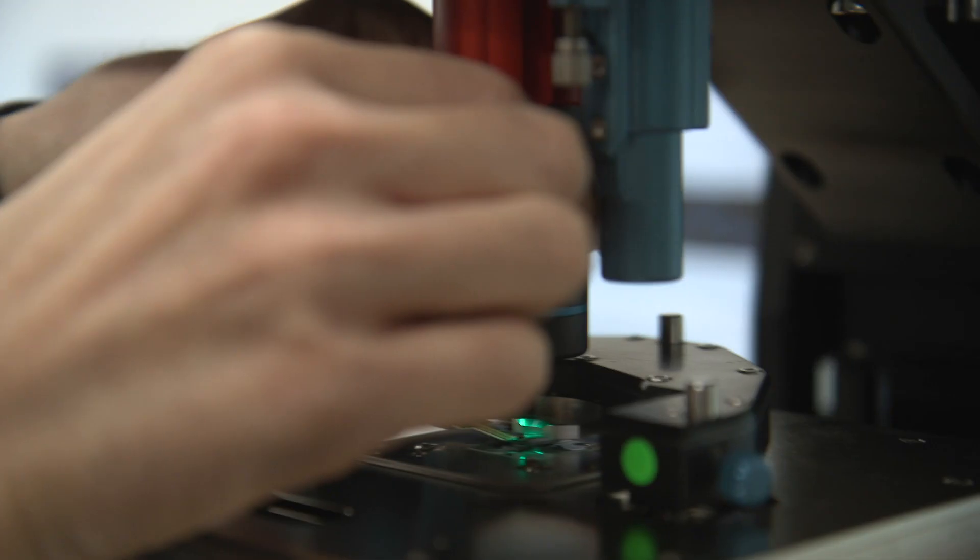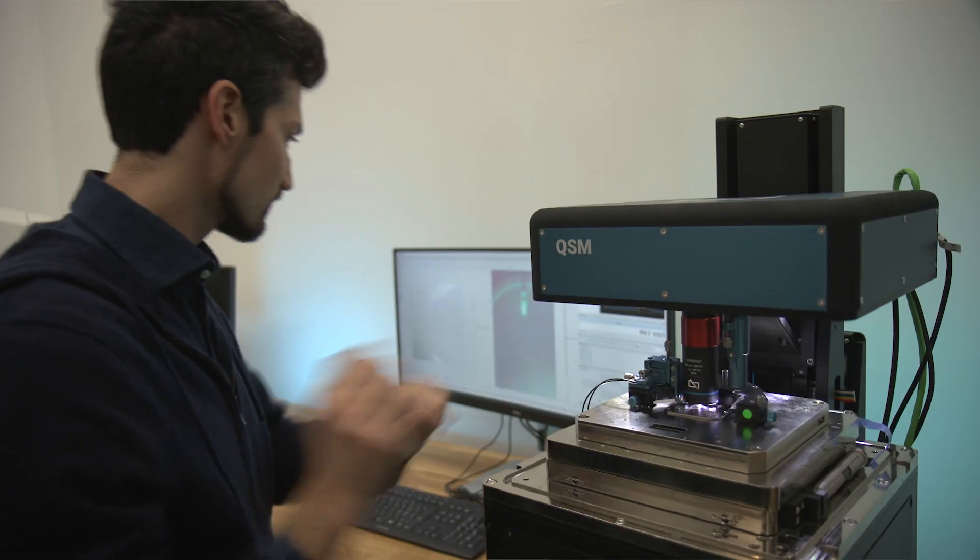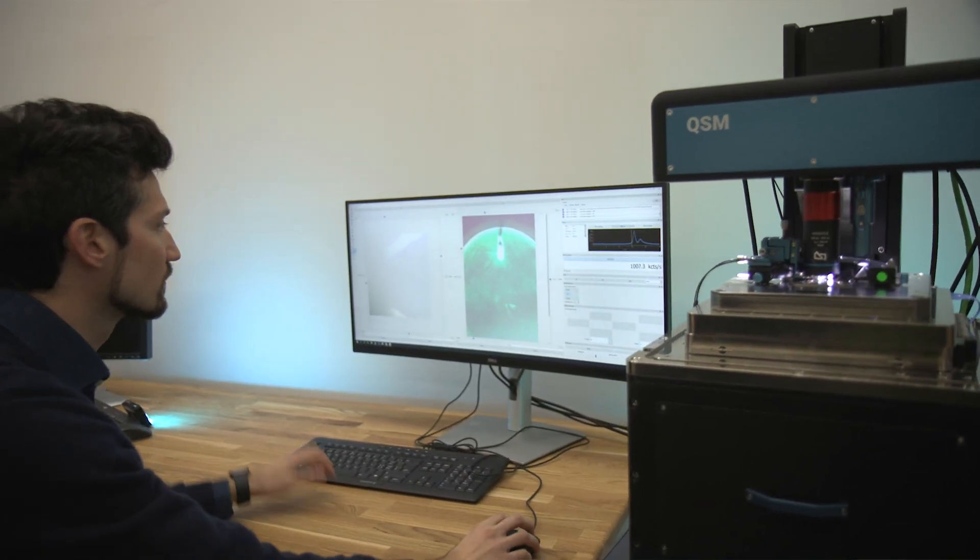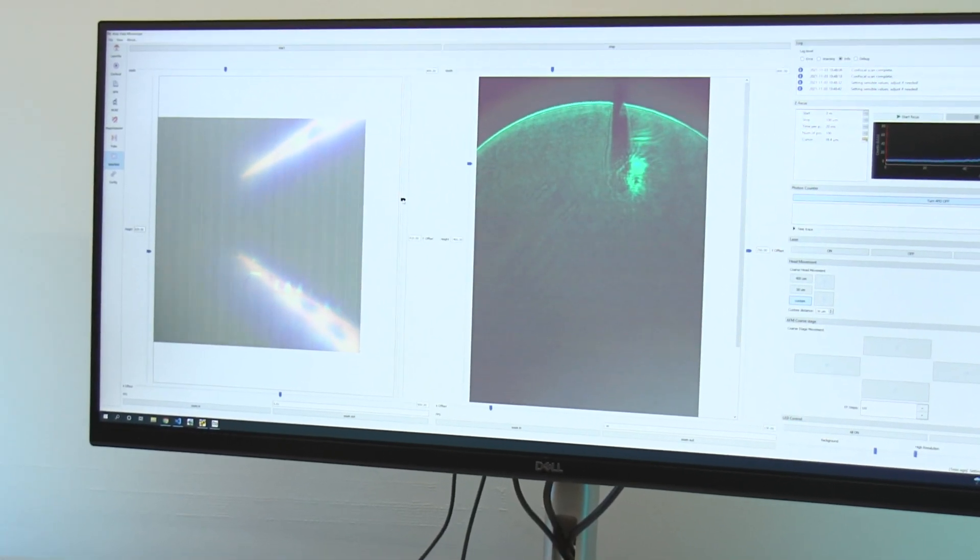Another unique feature of the QSM is really the optics set. We have put a lot of engineering and thought into designing custom optical elements that can maximize the collection efficiency of the fluorescence from the sensor itself. This impacts signal-to-noise that affects directly data quality and measurement time.